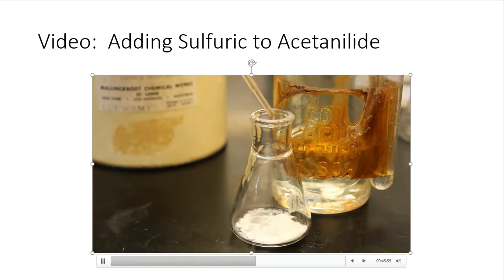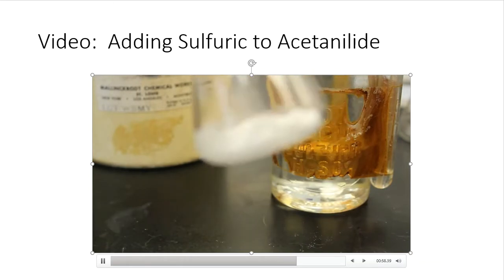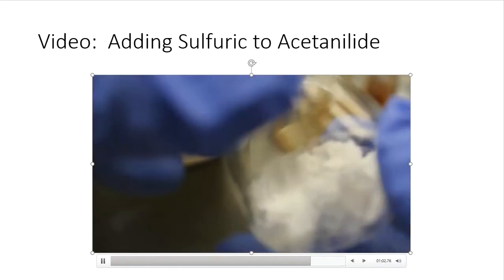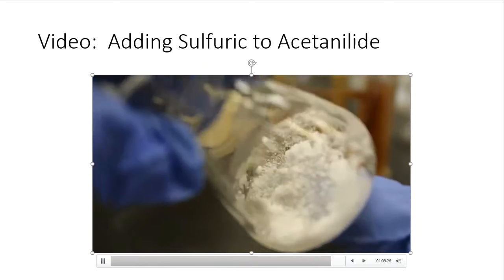And here goes the sulfuric acid addition. All right, guys. So as you can expect, the data sheet probably asks for observations. This is your observations of adding sulfuric to the acetanilide.